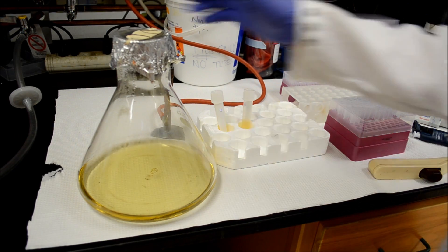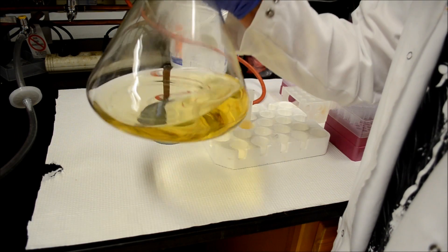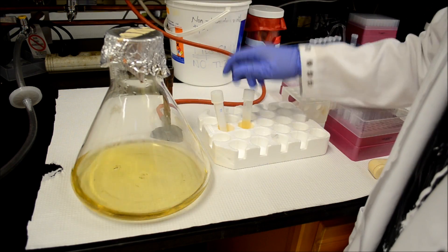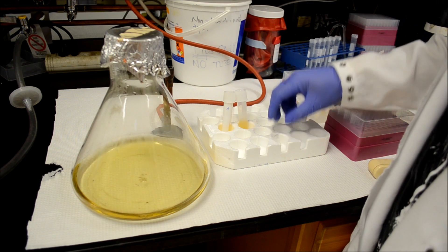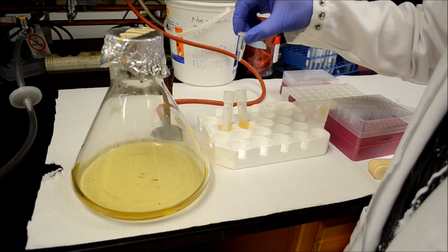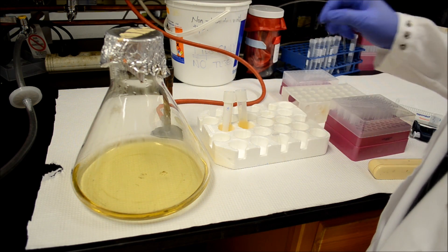Next, you have to inoculate a flask of LB media. Here's 500ml of LB, your overnight cultures, and a tube of ampicillin to make sure only your bacteria will grow.